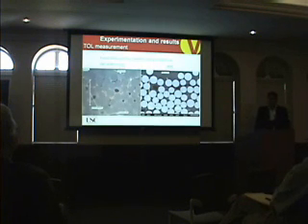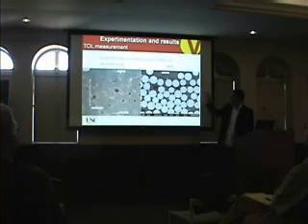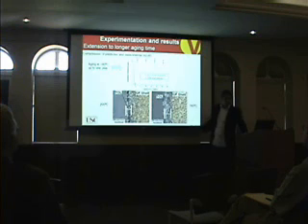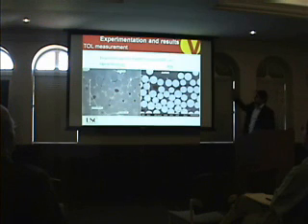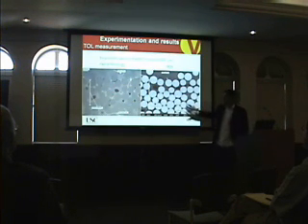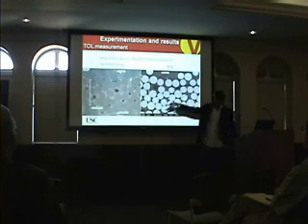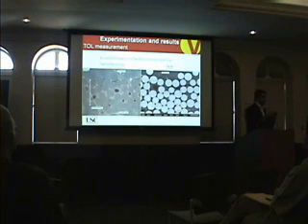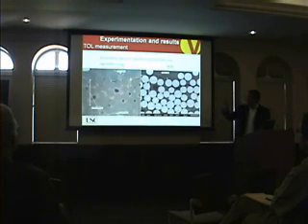So we got a new instrument in our lab, which is called an ion polisher. By ion polishing instead of abrasive polishing, as you see in the graphs here, you're going to get very, very good pictures. When the ion polisher cut our samples, we took a picture by SEM, and also we took a picture by optical microscope. As you see with optical microscopes, since the epoxy changes in nature and oxidizes, we have different colors, and we can measure the oxidation thickness.